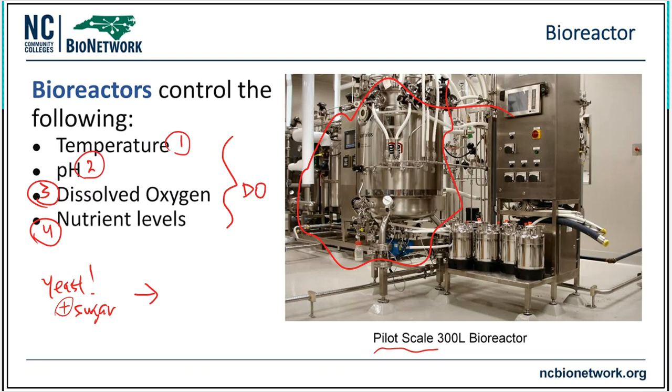Ding, ding, ding. That's a term I already know. And then it's going to give me outputs, and part of that output is going to be CO2 gas. Bubble, bubble, bubble. And as long as that tank is bubbling, that means CO2 is getting made, and that means the yeast is doing the work.